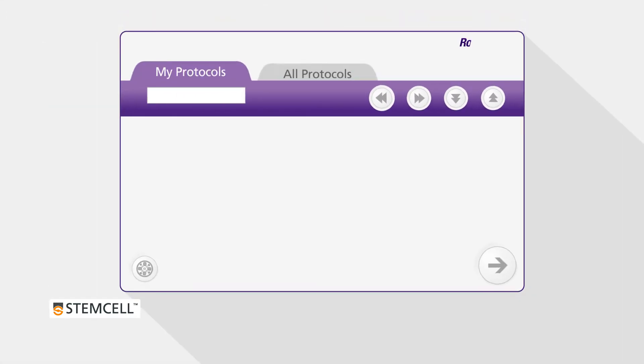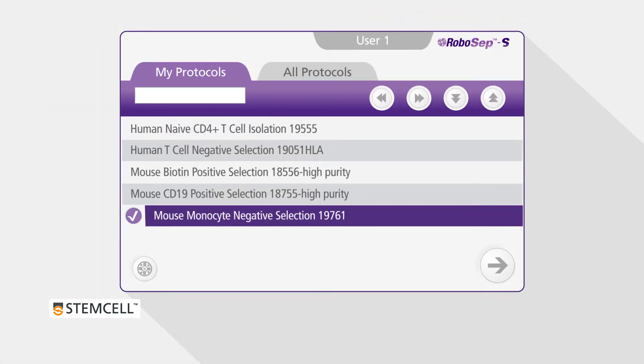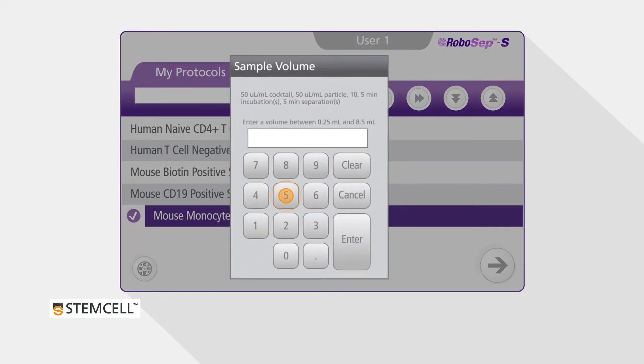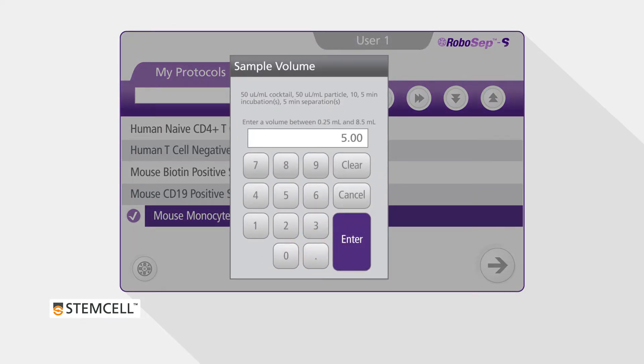After selecting the desired protocol, you'll be prompted to enter the appropriate sample volume. Fill in the volume and press enter.